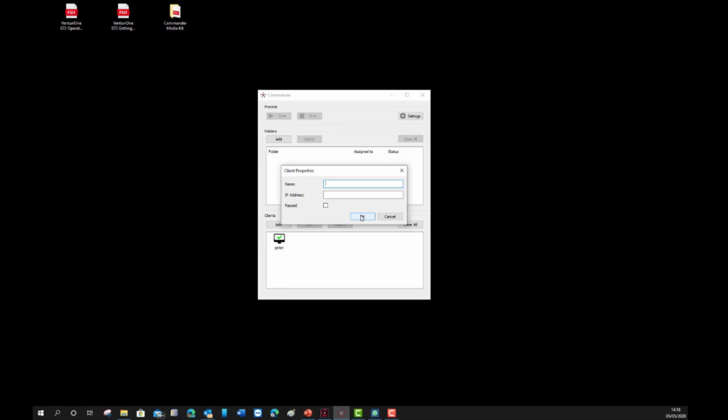The client PC must be running VenturiOne software. If the system can connect to VenturiOne, you will see a green tick. If for any reason the system can't connect to a client, you will see the red spyglass, indicating that it can't see a copy of VenturiOne.